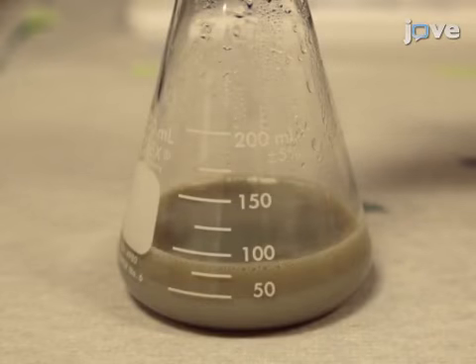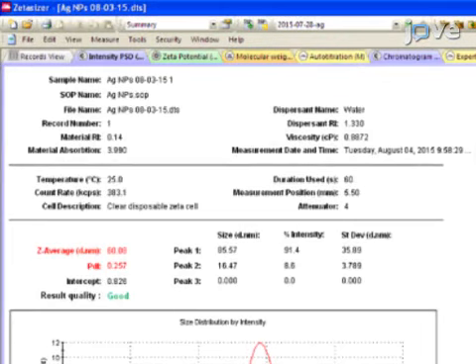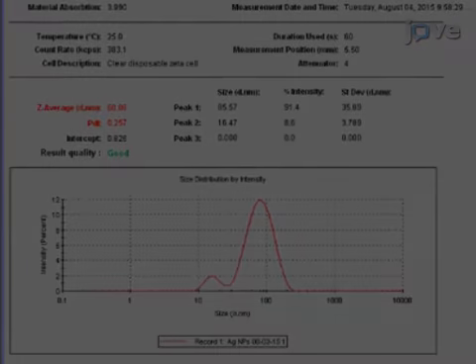Proceed by diluting the mixture with ultrapure water to 100 milliliters. Then, use a zetasizer to measure the size of the silver nanoparticles.